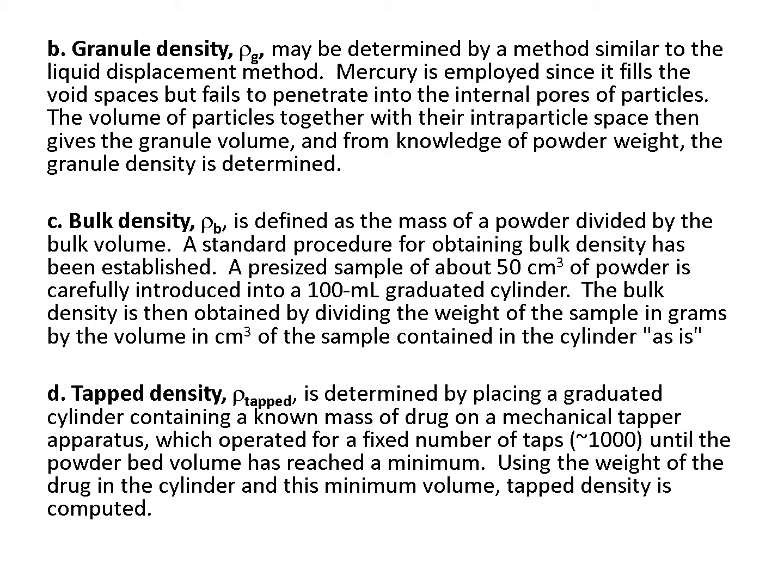To measure the bulk density, we can use a cylinder, just putting our amount in that cylinder and measuring the volume of that sample. It will be slanted, مائلة. So we'll take the upper limit of the volume and the lower limit and take the average.